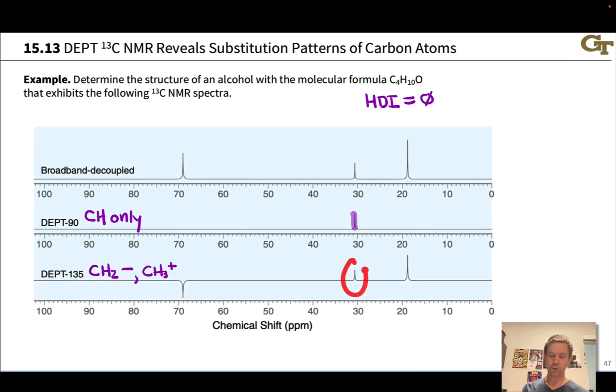In the DEPT-135, we already know that signal corresponds to a CH group, so this other positive signal must correspond to a CH3, and the negative signal must correspond to a CH2. We have identified all the substitution patterns of all three distinct sets of carbons in this compound. Just to review: negative in DEPT-135 is always a CH2. Positive in DEPT-90 is a CH. The remaining signal by default must be a CH3, since it's showing up positive in DEPT-135 as well. We have no quaternary carbons. Every carbon's got at least one hydrogen connected to it.